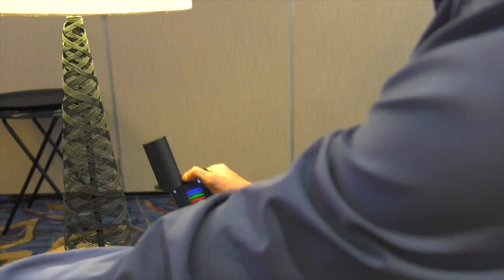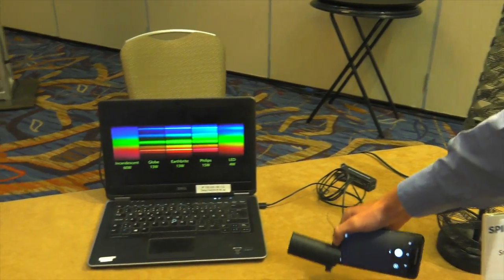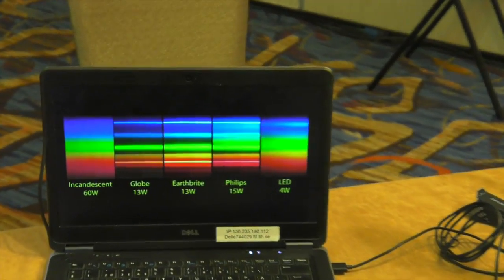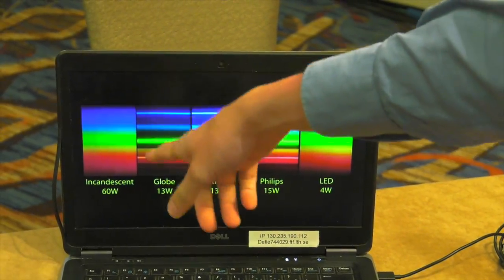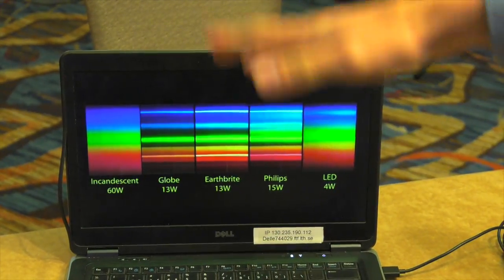And here I have a bit of sampling. This is an incandescent lamp, the old lamps which no one uses anymore, which gets really hot with tungsten, which has a broad spectrum across the visible wavelength.